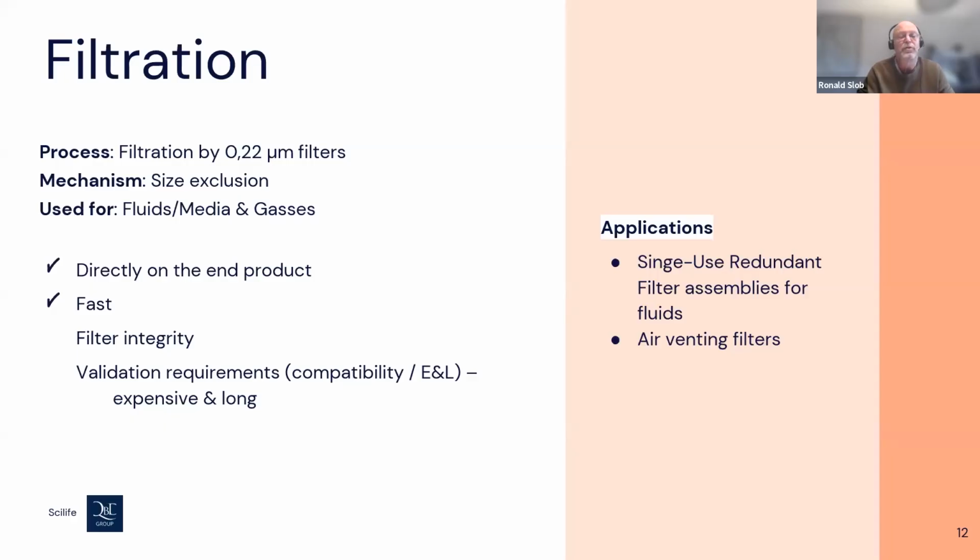The filter itself must be sterile, so that is also a thing. If you want to use it, be sure that you have a validated mechanism or process to sterilize the filter up front. And the main advantage is that it's quite fast. That is the main advantage.